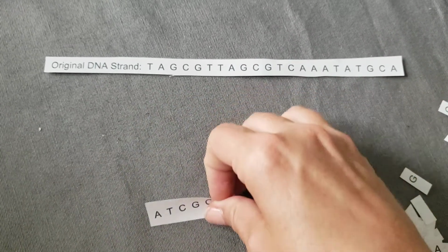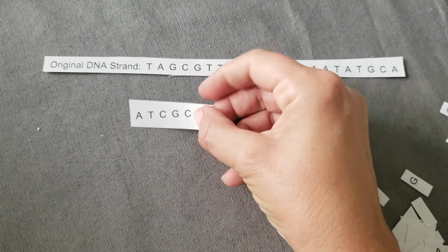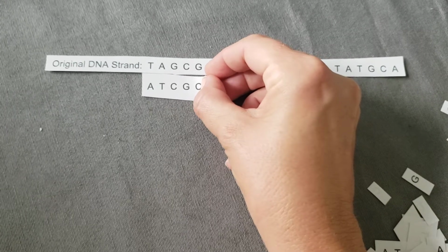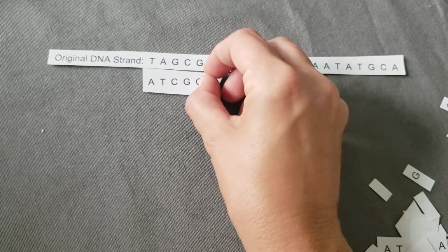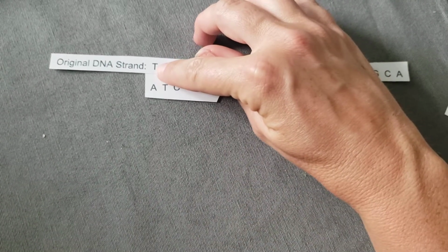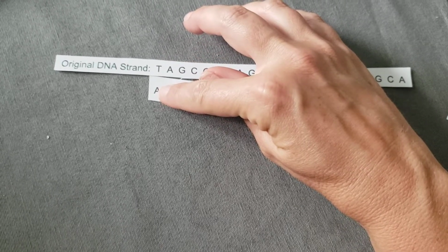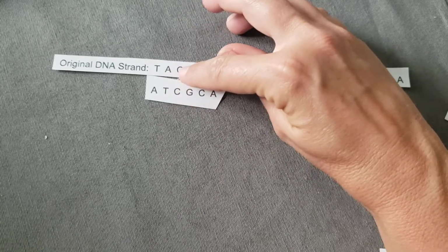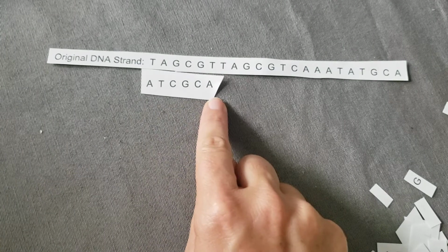The next piece, once the DNA strands have separated, is that we take the temperature down about 20 degrees Celsius, and that allows a primer that you've added to the mix to attach or bind to complementary base pairs. So if we have a T exposed on one of our strands, we'll have the A portion of our primer that would bond to it. The A exposed here would bond to a T, and so on. So this little primer right here was predetermined.